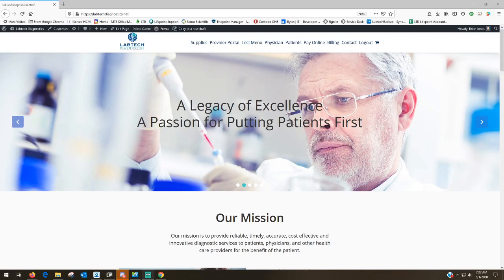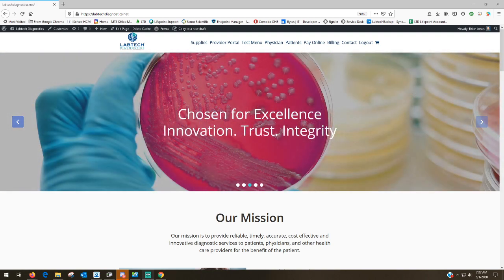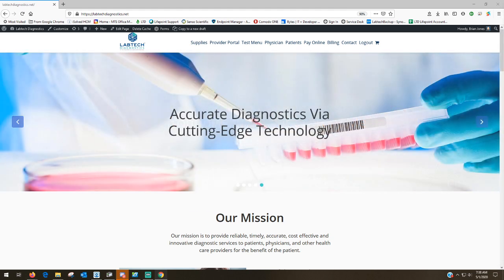I work at Labtech Diagnostics, and I'll be showing you how to use the Labtech Diagnostics LifePoints. This will be how you enter tests in, check tests, and it's just our all-around portal for our lab tests.